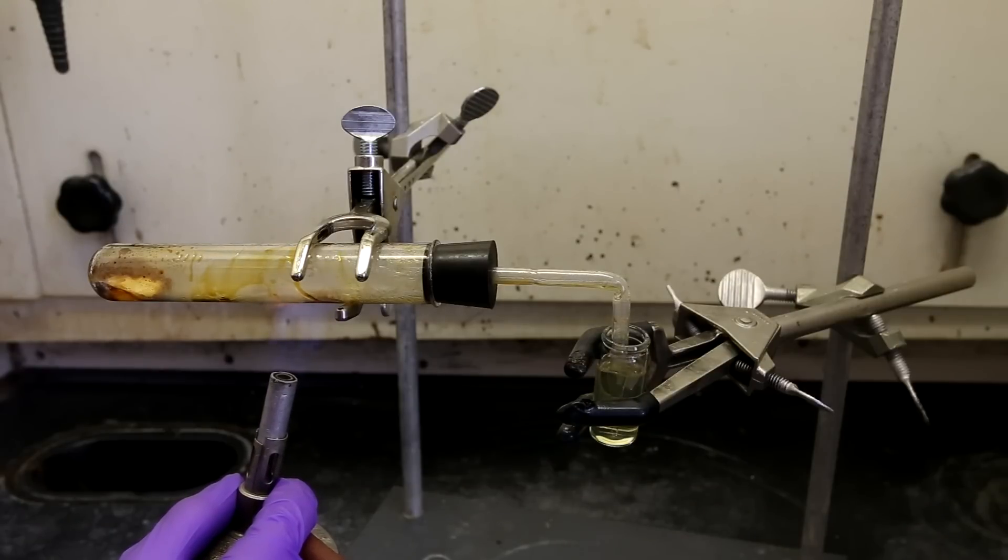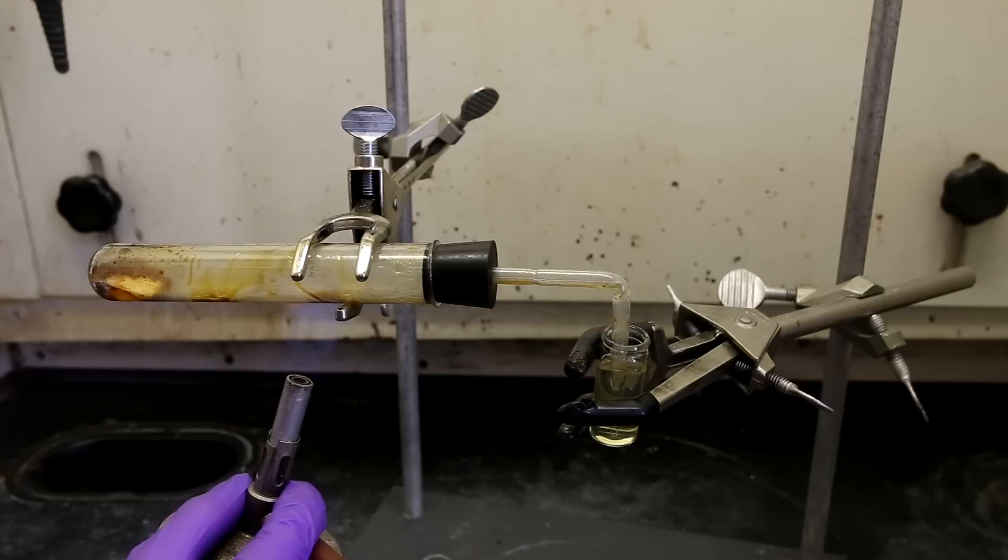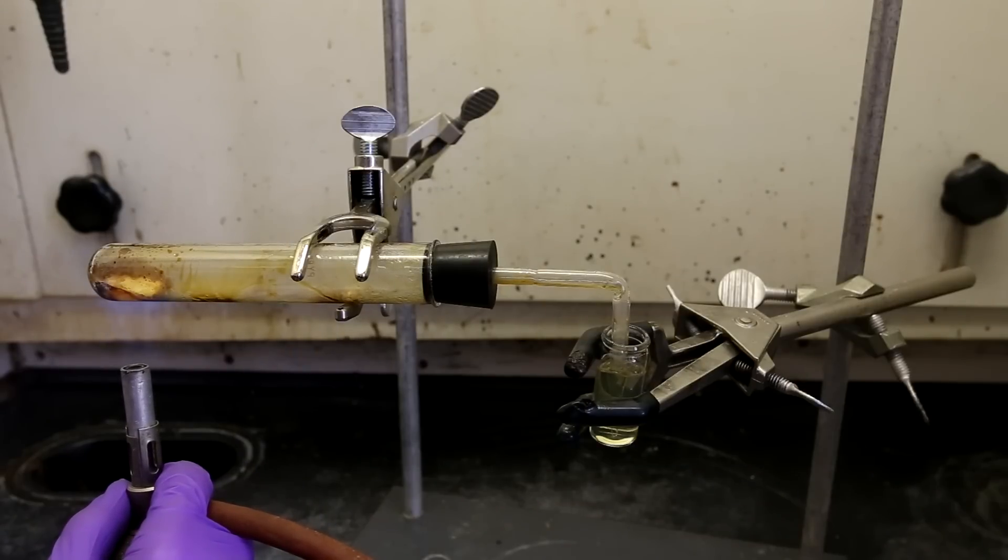In almost every case of destructive distillation, this is completely undesirable. The easiest way to avoid suck back is to remove the dram vial before you remove the heating. This way the suck back will occur but it will only pull in air and not your water solution.